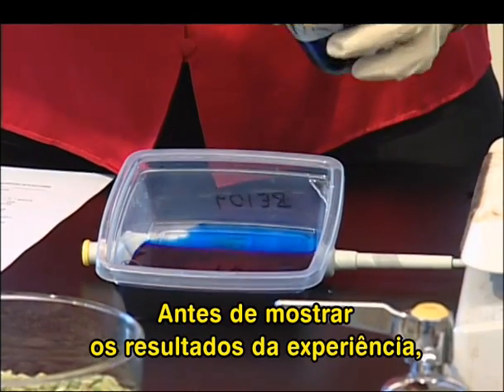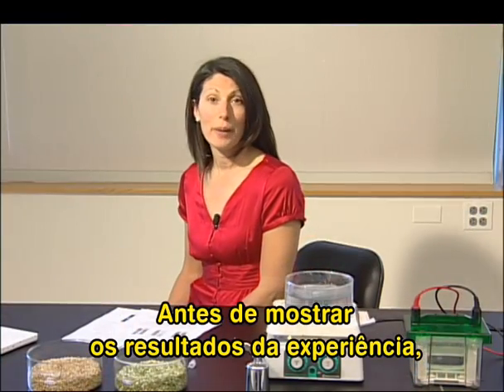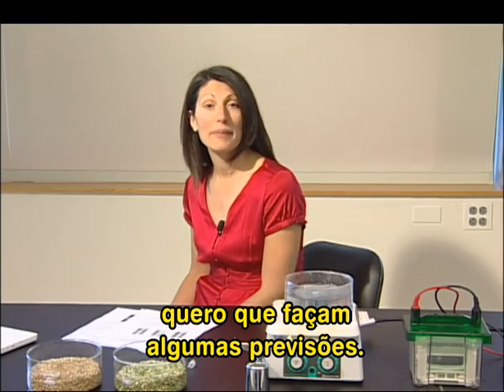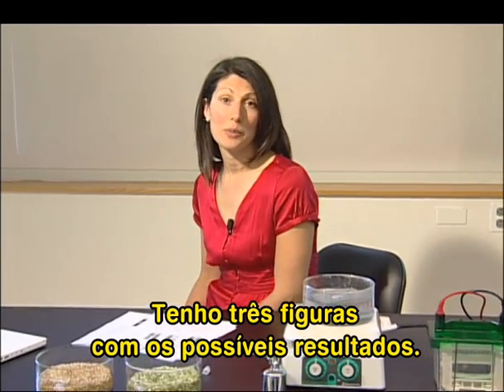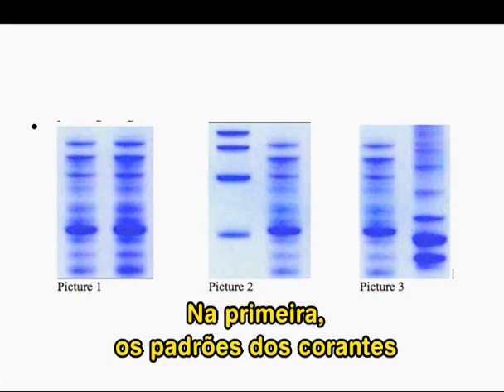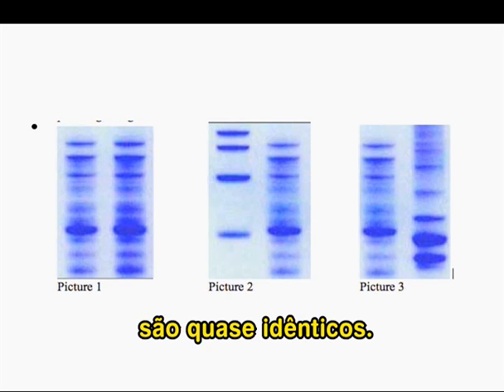And before I show you what the results of this kind of an experiment might be, I'd like you to take some time to make some predictions. I have 3 cartoons for possible outcomes from this kind of an experiment. In the first cartoon, the 2 blue staining patterns look almost identical.